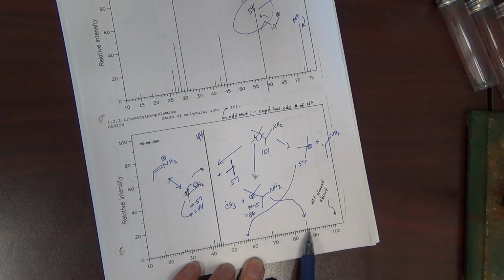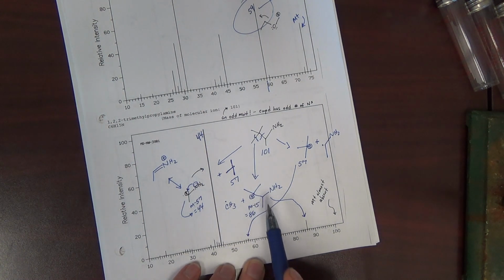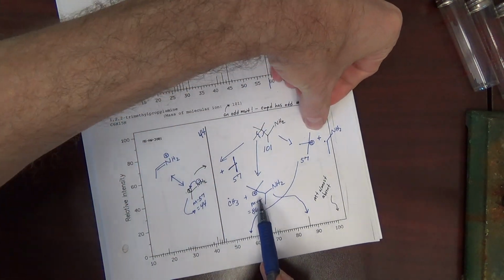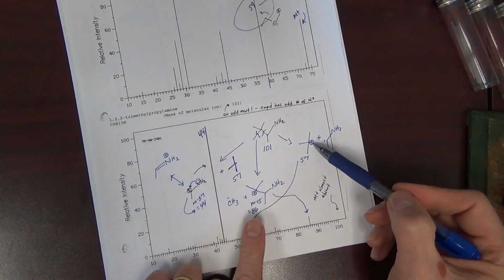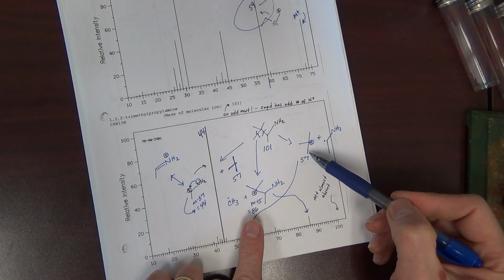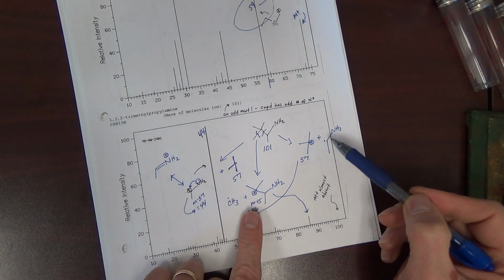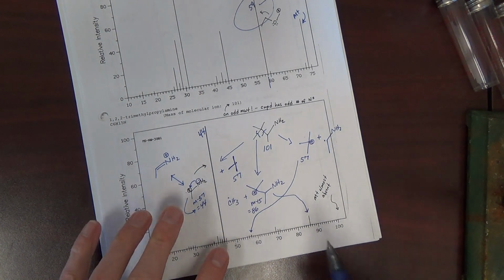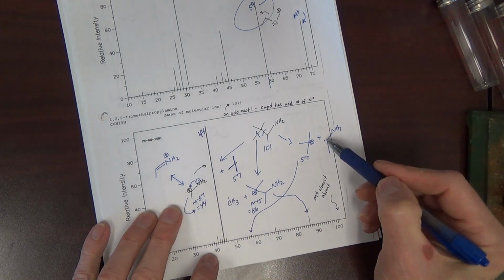So we can maybe predict a structure for the 86 here. Seems reasonable, tertiary. Why was this route better than this route? I mean, they were both tertiary. It's a little bit counterintuitive.